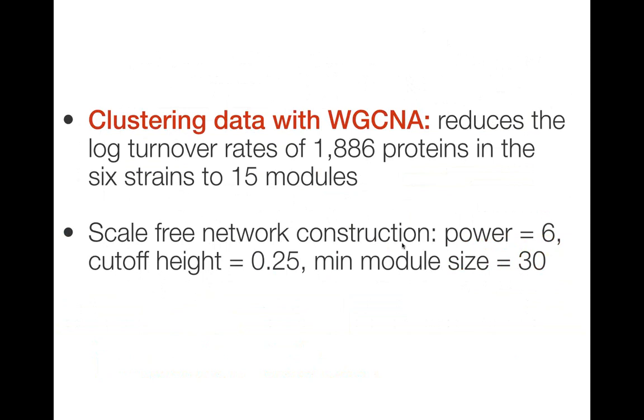So we wanted to cluster all the data together and see where we could discern any structure in the data, any patterns that we could see. So we used a package in R called WGCNA, which stands for Weighted Gene Correlation Network Analysis. It's quite similar to clustering, I think, given the size of data that we have.